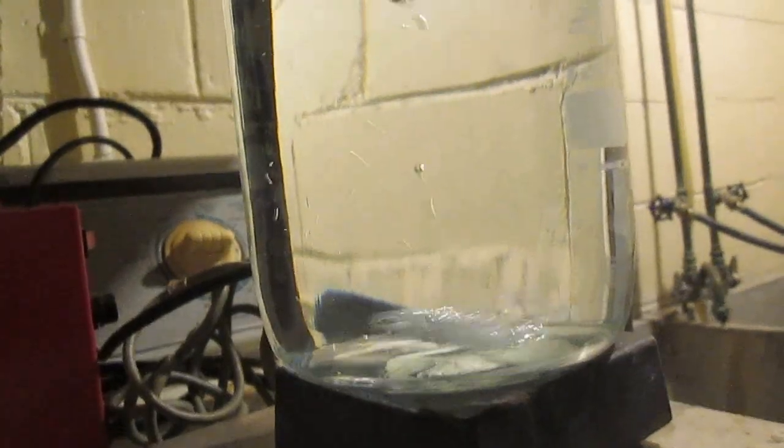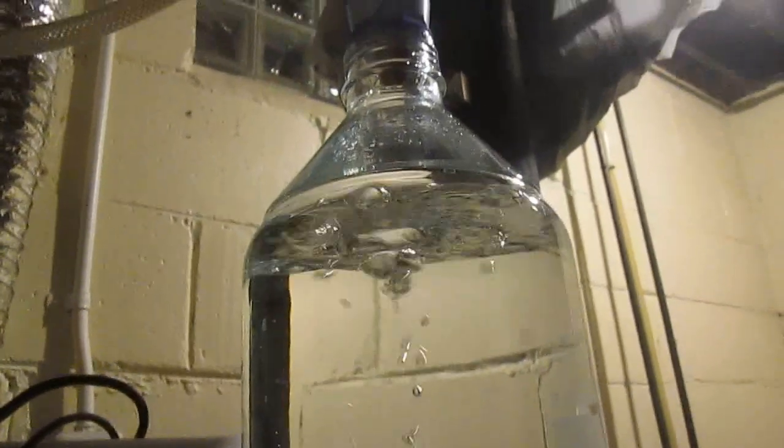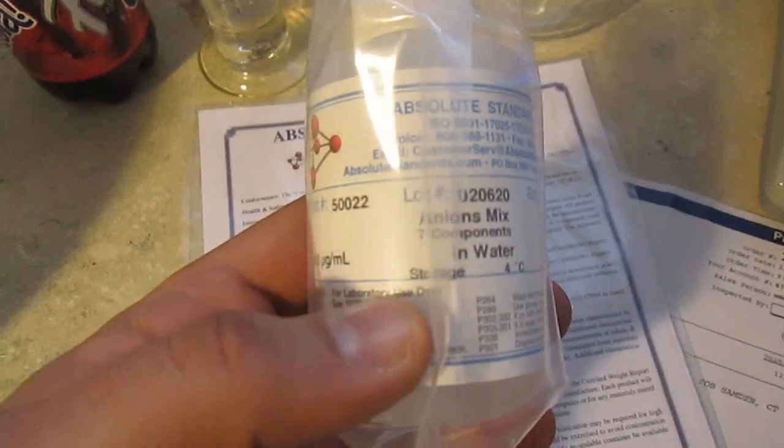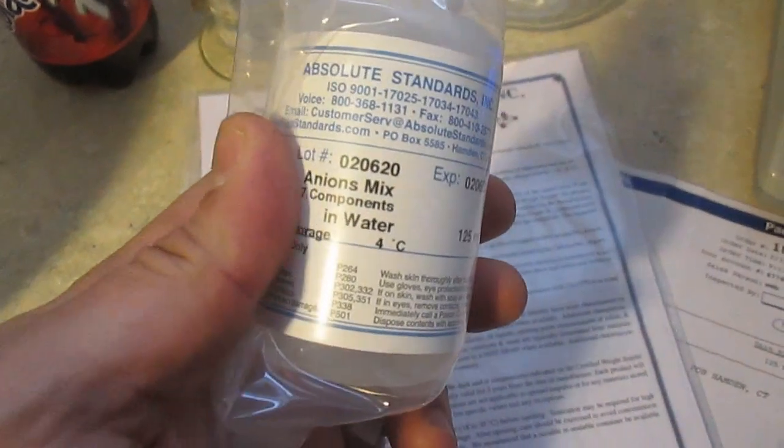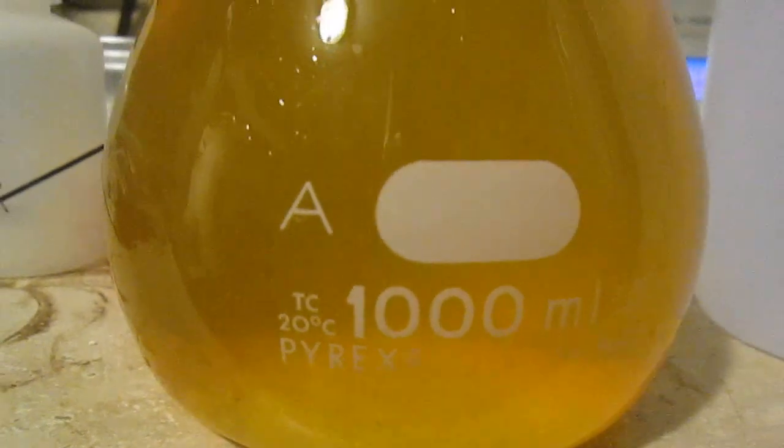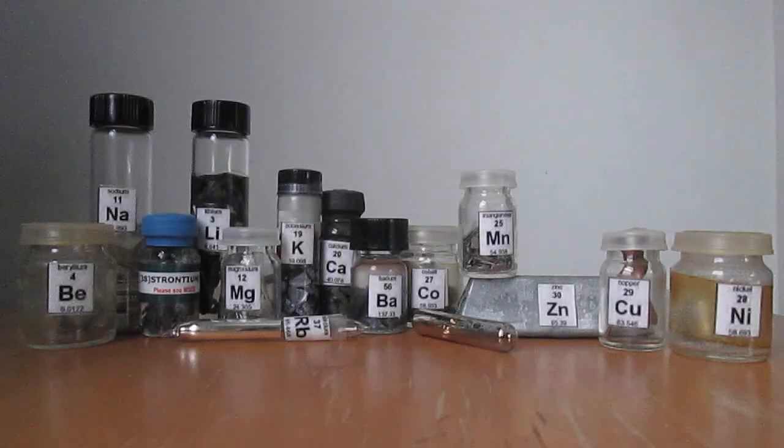By the way, if you have any ideas, suggestions are always welcome. I've also purchased a standard to build a calibration curve and to quantify these anions as accurately as possible.